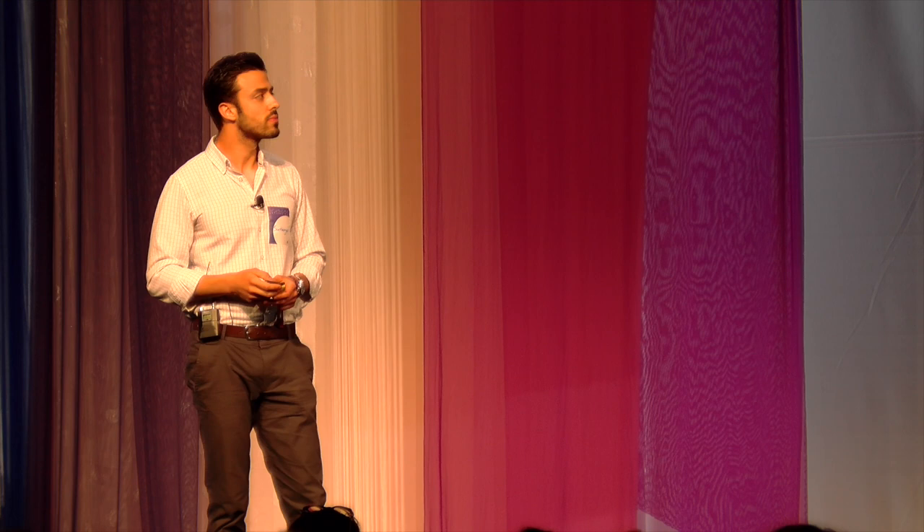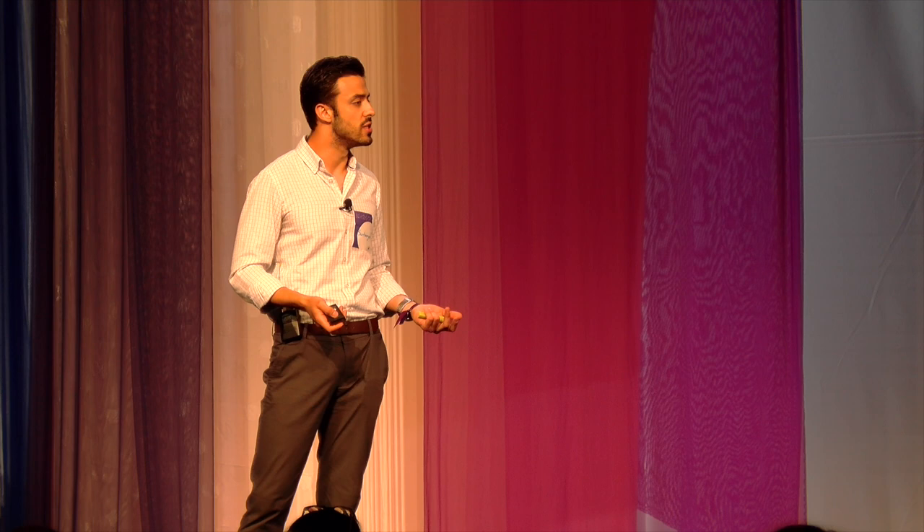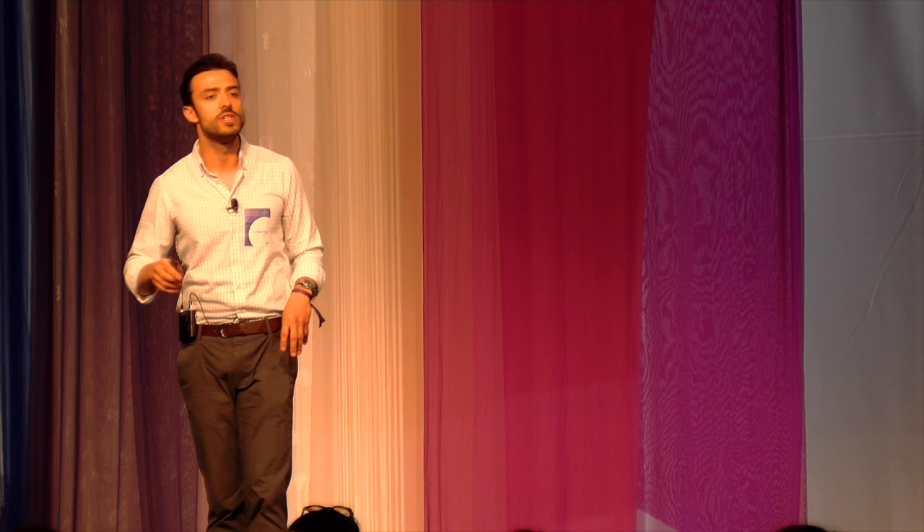The next question was: what happens when we culture cells outside of the vascular bundles, on the non-vascularized tissue? This is roughly what 90% of the celery would look like under the microscope. We labeled the plant cell walls with the same fluorescent dye, repeated our experiments — 10 days of growth, five days of differentiation — and the myotubes appear somewhat randomly scattered. Using the same image processing algorithm, we get a relatively flat histogram, confirming no preferred orientation.